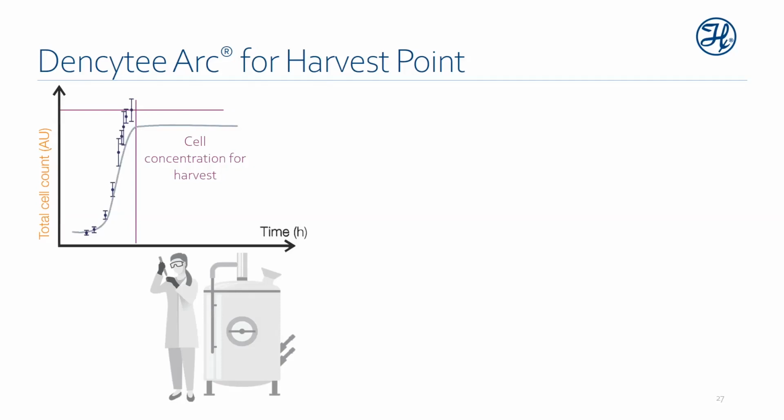And so while you can use this historical signal for early phase process action, it really falls short on the upper end here, specifically say during harvest point. If you use the offline OD correlation tool and combine measurement modes, you can get high linearity and correlation against offline OD throughout the entire run. So you can use the inline OD sensor for endpoint determination as well as early phase.